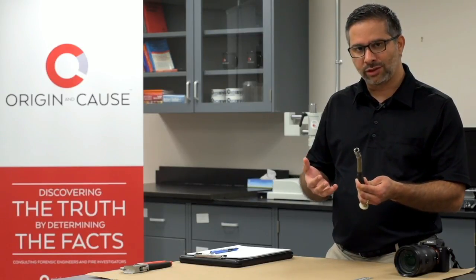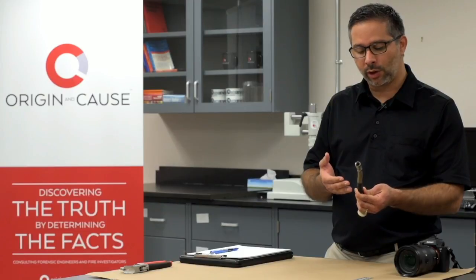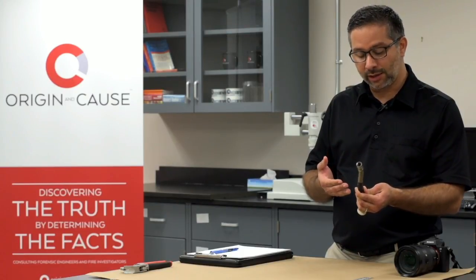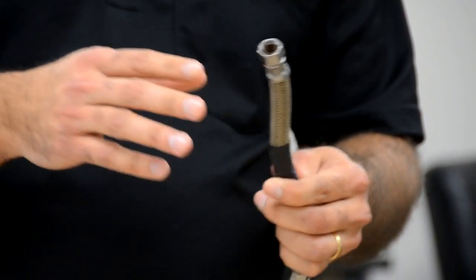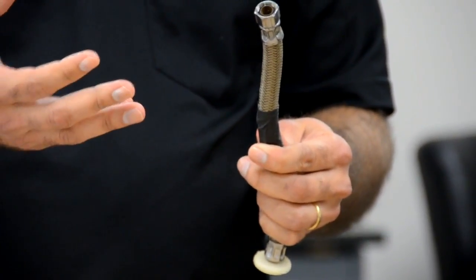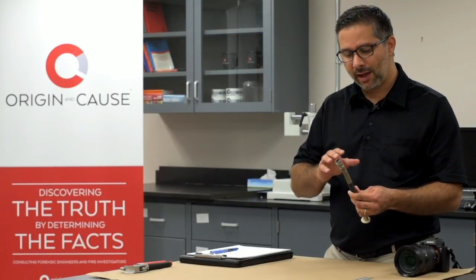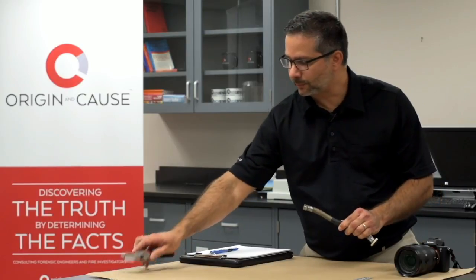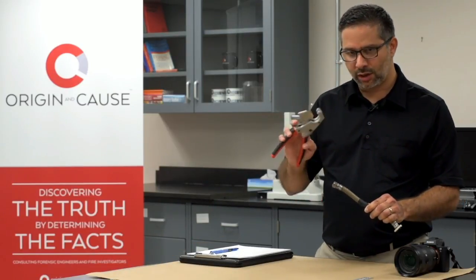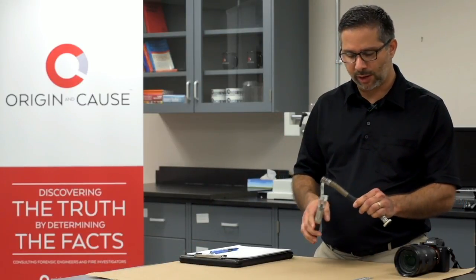Typically we have to do destructive testing to understand what goes on with the inner hose, and assuming we can do that, then we would cut into the hose and expose that inner hose. We would basically take it to the microscope and look at it. Today, for the sake of the examination, let's go ahead and cut a section of it, and I'm going to show you how it looks under the microscope.